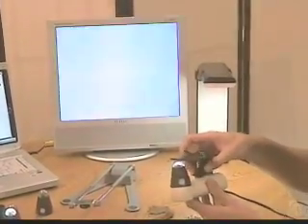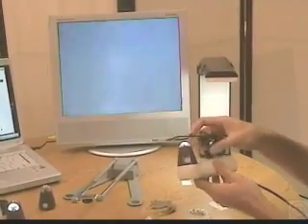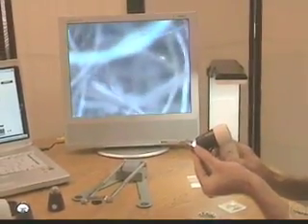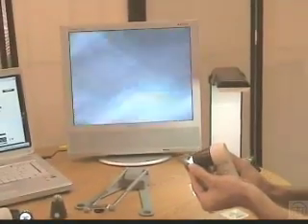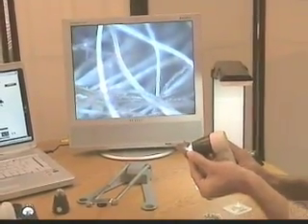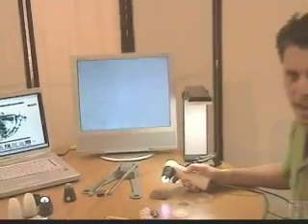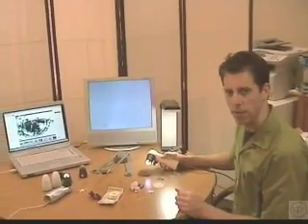Now I'll go back to the handheld mode with the Scope on a Rope and show some yak wool at 200x. You just touch, and the image is displayed live on the television set instead of on the computer, with the Scope on a Rope L2. Go ahead and take a look at the rest of the site and our other products, and give us a call if you have any questions.